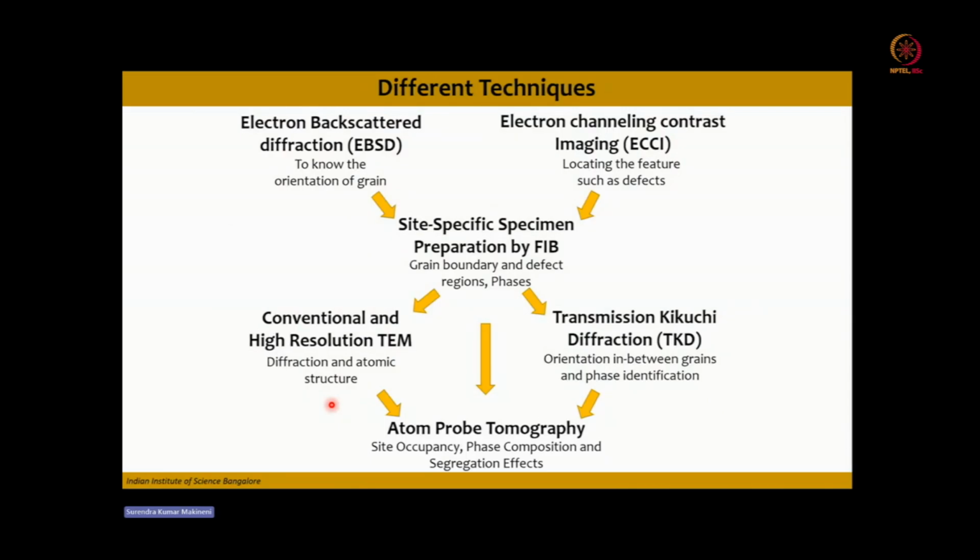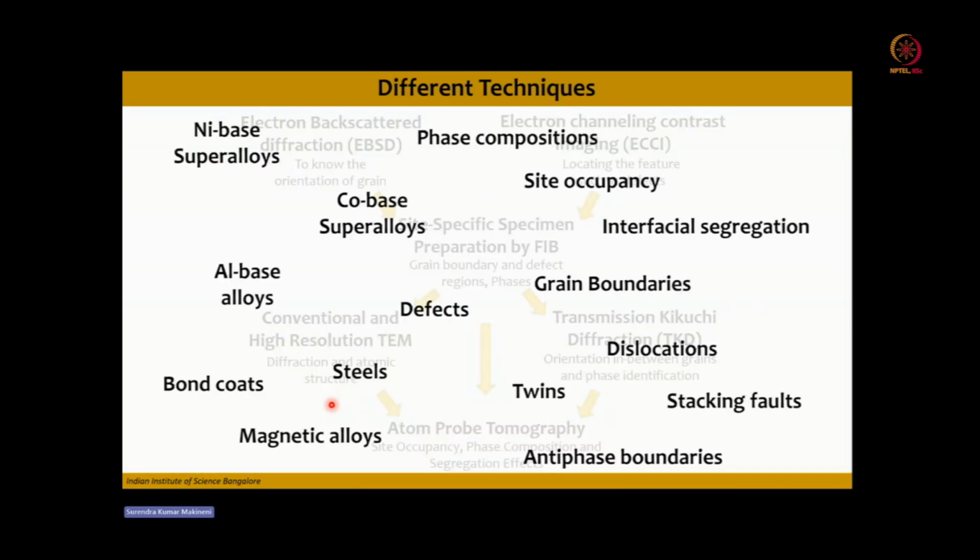These are the different techniques and steps we can perform for a specific purpose of investigation. Okay, we can investigate defects, twins, dislocations, stacking faults, grain boundaries.